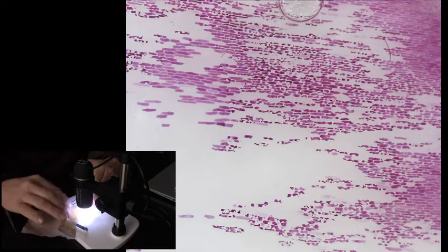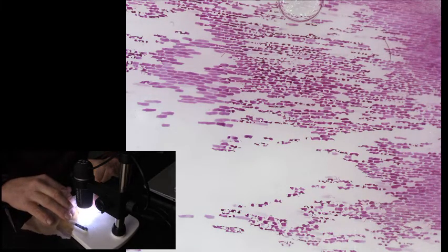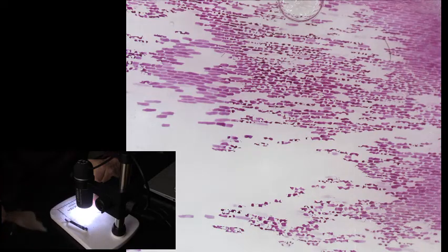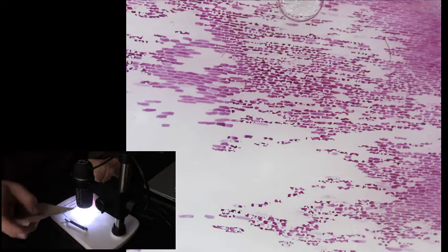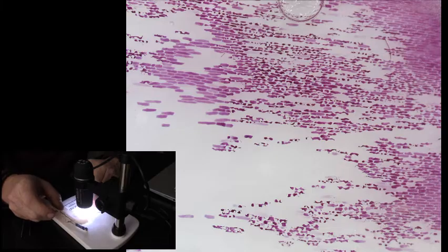well, check it out. You can see them shrinking right in front of your face. So the water within the cytoplasm is about 96, 97% water.